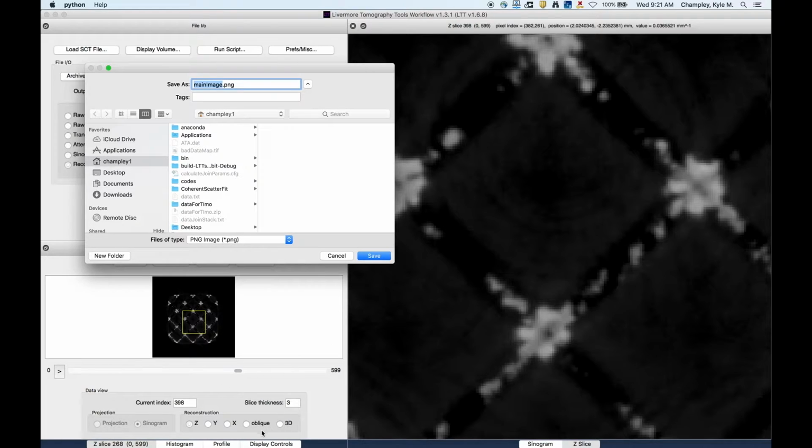in the screen, maybe you've done some averaging, but you want to export that in such a way that LTT or some future analysis software can look at it, you want to save it as a TIFF or an SDT because a PNG image is compressed. So you could select these. If it's an SDT, it'll be in float. If it's a TIFF, it'll save it as a 16-bit unsigned integer, but it also carries in the TIFF header the slope and offset to convert it back to floating point, which will automatically be done if you're using LTT. When it loads a TIFF image, it'll look for that in the TIFF header and convert it to floating point. It's just a neat little trick to save some disk space.